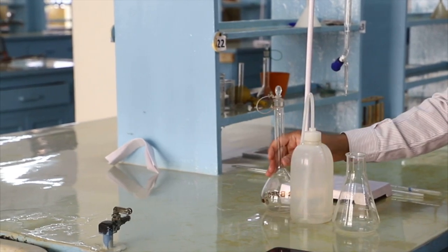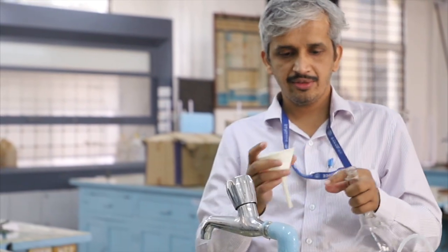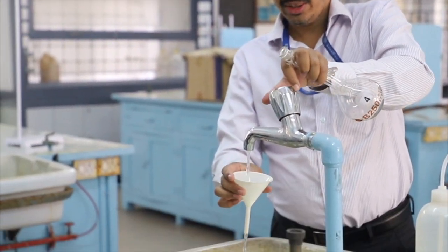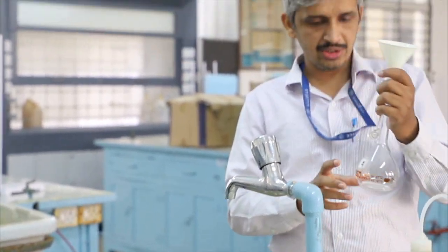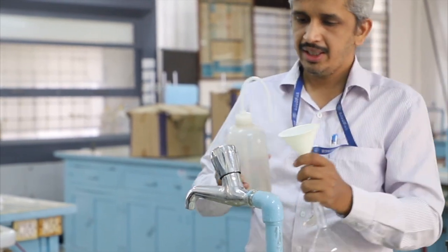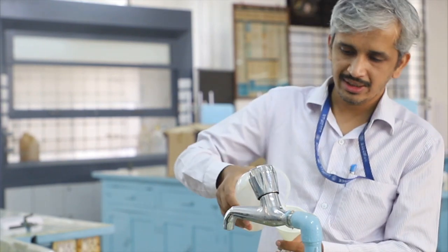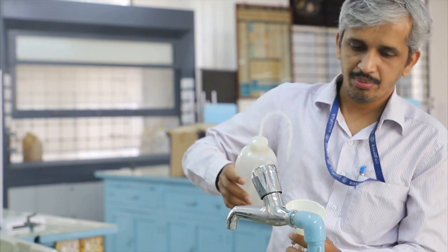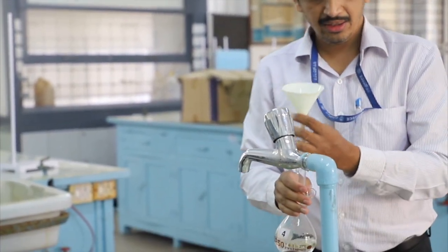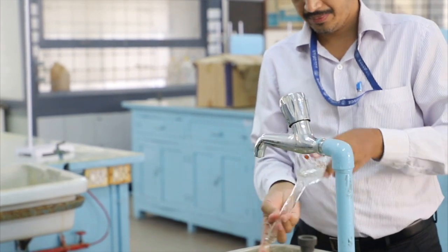Since the standard flask is washed with tap water, the funnel also should be washed with tap water, and it can be placed above the standard flask. Now both standard flask and funnel are only washed with tap water. Now the funnel as well as the standard flask should be rinsed. You can see I am just adding water in such a way that the funnel is properly rinsed with distilled water, and also you can rinse the standard flask.